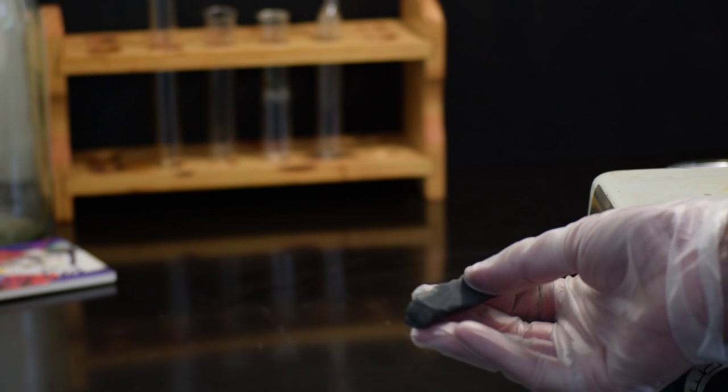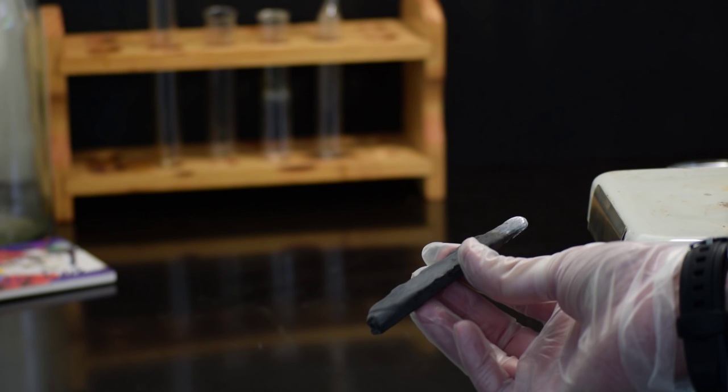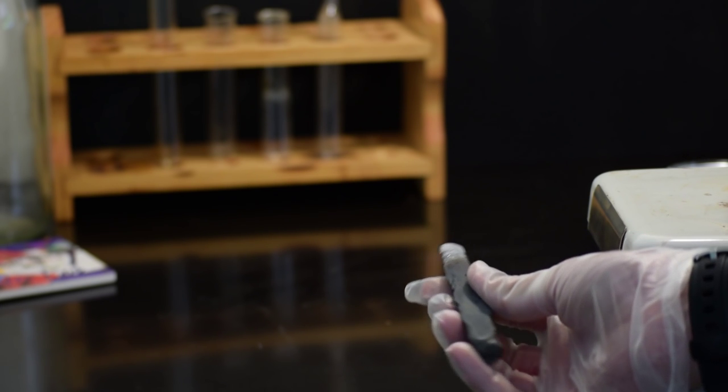Here is the finished lead dioxide coated electrode. As you can see, I took a little bit of sandpaper and carefully sanded the top so I have a conductive surface to hook electrodes onto.